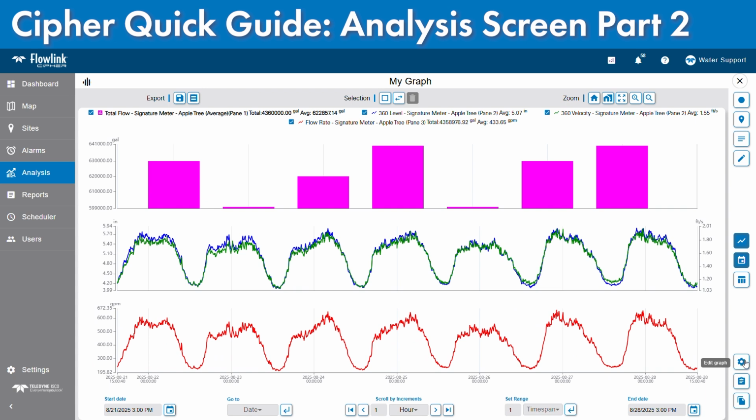So now you can tweak it, add more data sets, change colors, anything that you want to do, but you don't have to start from scratch because you use somebody else's. So that's what the save graph is. That's just one example. Another example is, let's say I don't want to mess with my original. The one I had before, I want to keep it as is, and I want to build on it, but I want to leave it intact.